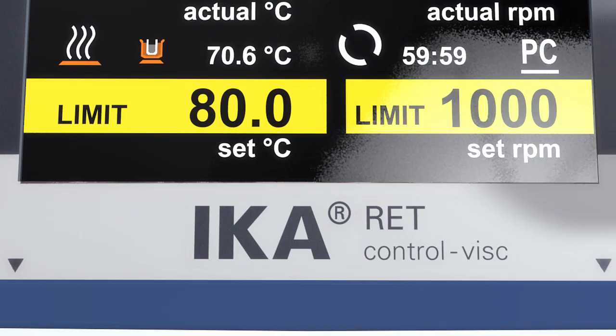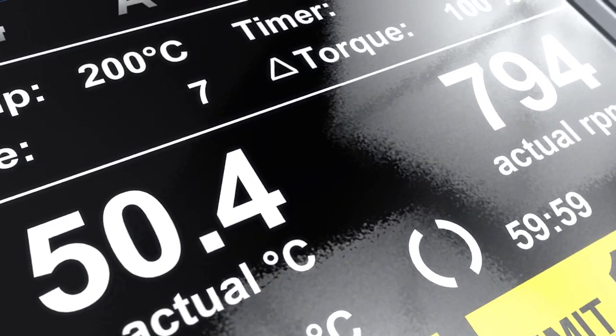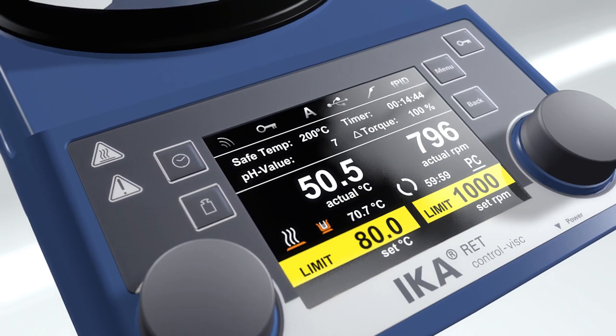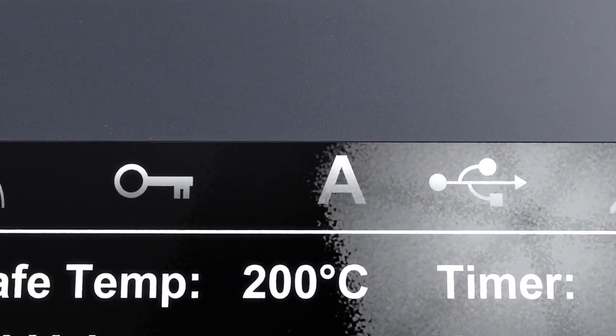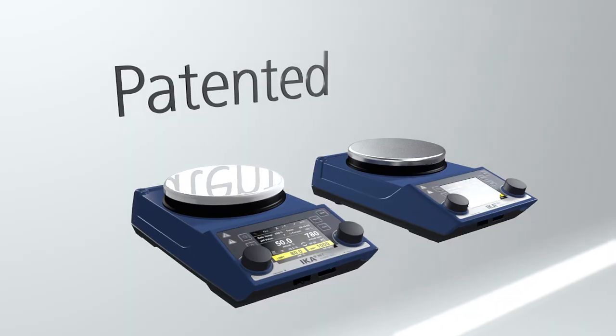The display also shows torque, limits, actual values, temperature sensors, connectivity to any of the interfaces, the current operating mode, and the lock function. Patented.